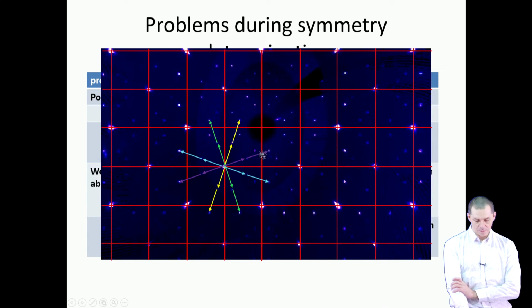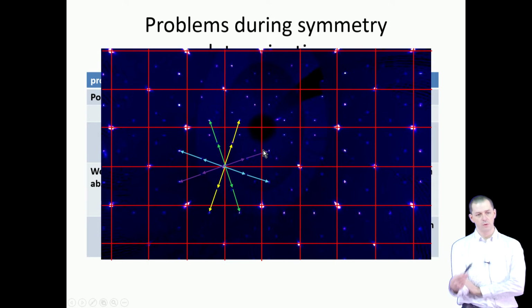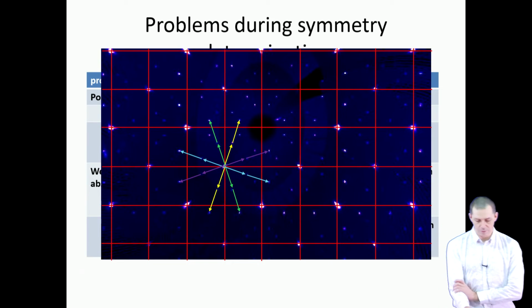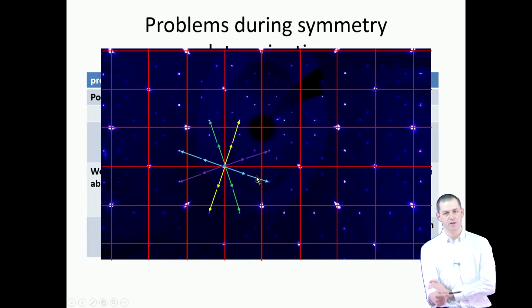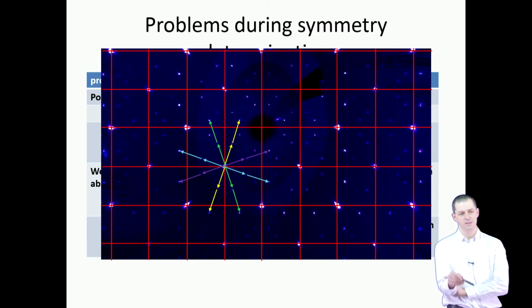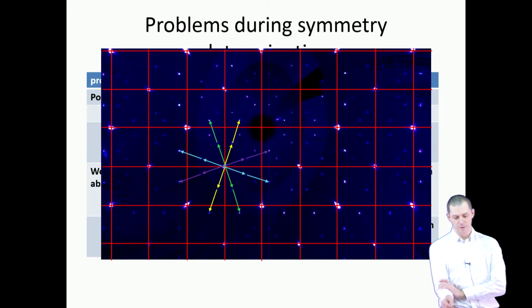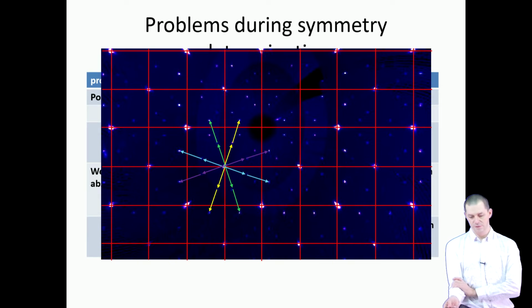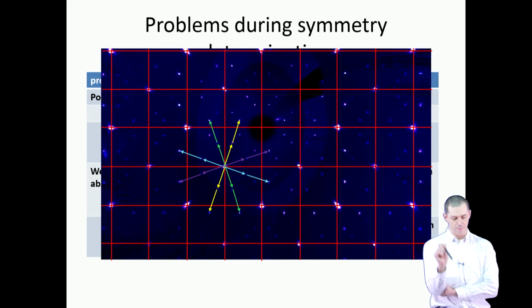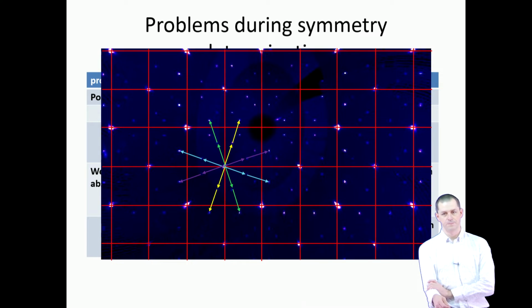And then, because this satellite is possible only in monoclinic symmetry, there are actually 4 different possible orientations of the monoclinic structure in the tetragonal lattice, and that gives a 4-fold twinning. So the real, correct description of this diffraction pattern is a monoclinic diffraction pattern, modulated structure, and 4-fold twinning.